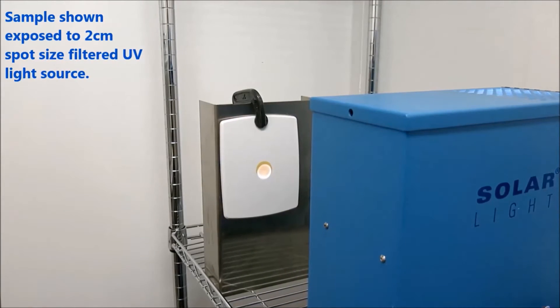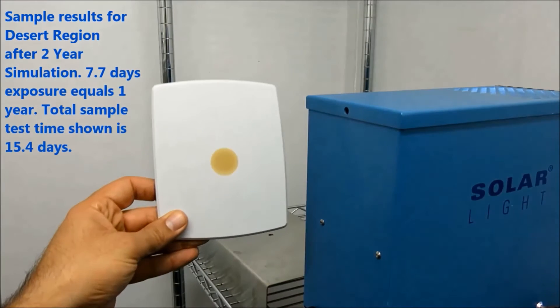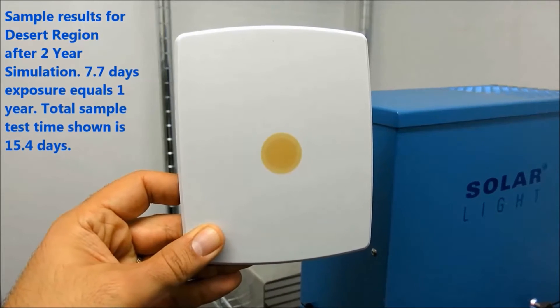Many options such as the right angle beam assembly, liquid light guides, lab jack stands, and much more are available for this kit and shown throughout this video.